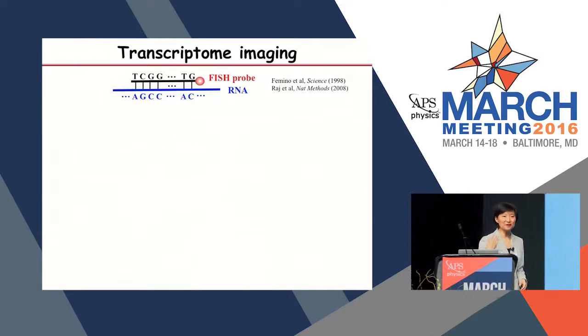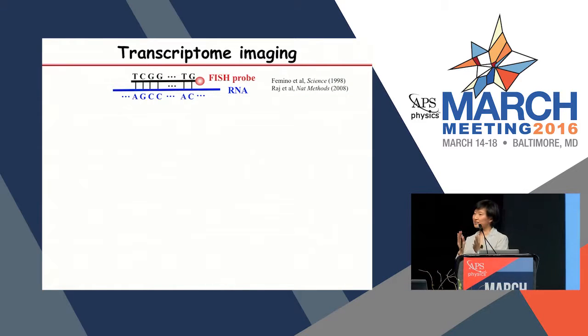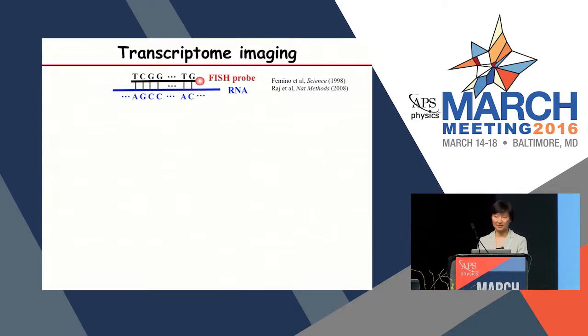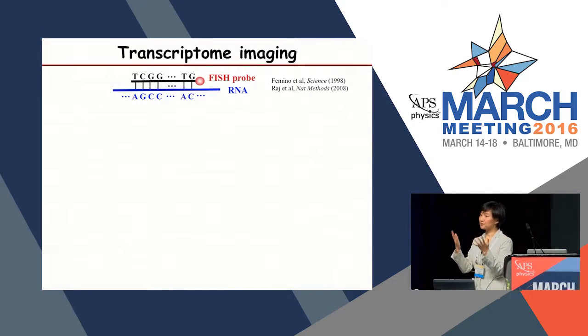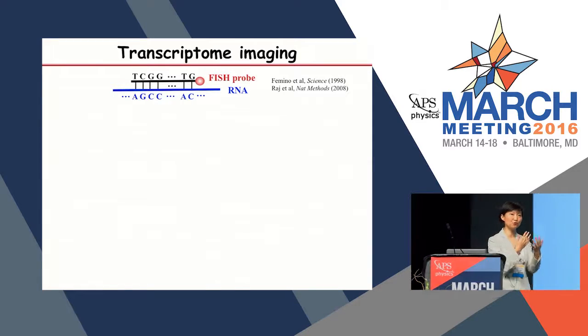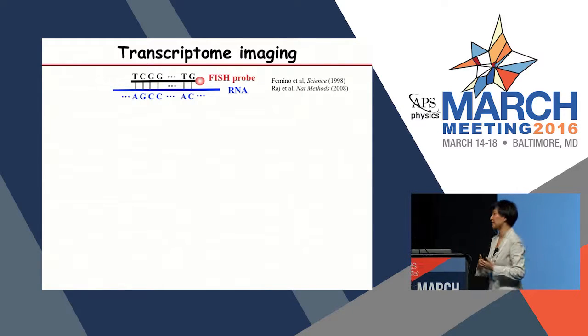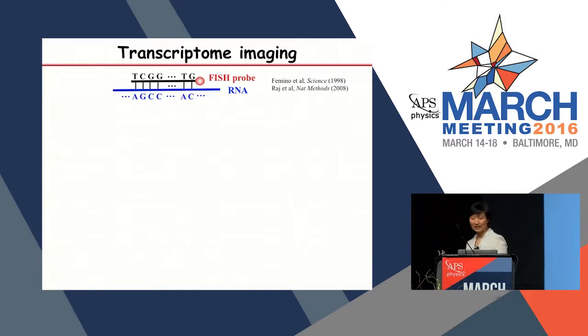So we use single molecule FISH, which was pioneered by Rob Singer, that gives you very high detection accuracy of individual RNA molecules, and was perfected by people like Arjun Raj and Alexander van Oudenaarden and so on. And then you can use multicolor imaging and multiple different color FISH probes to look at multiple types of RNA species. You could even imagine a smart combinatorial approach to do colors to get 20 or 30 species of RNA simultaneously, as Singer, Raj, and Long Cai have been doing.